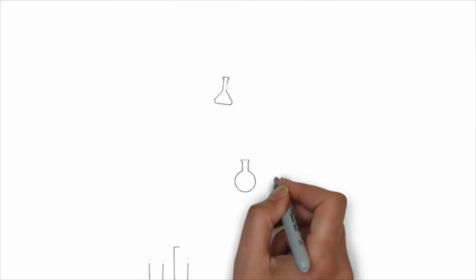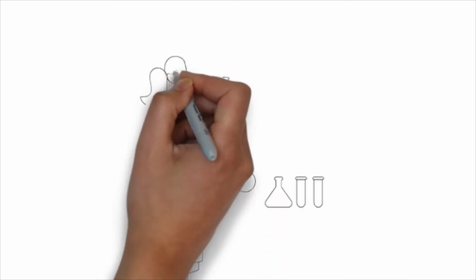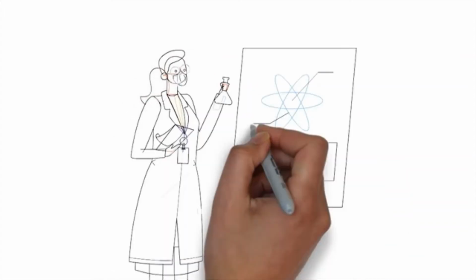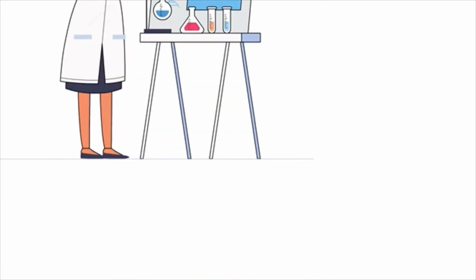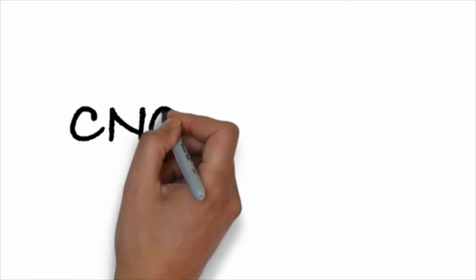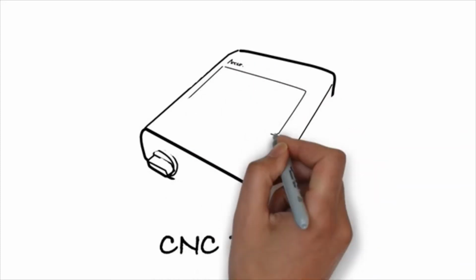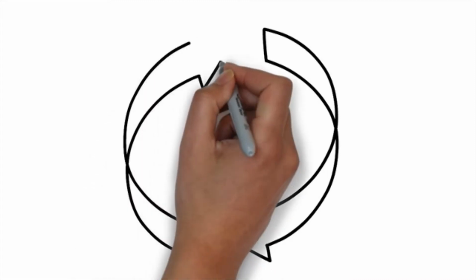Wait a minute. Don't people actually move and breathe when they are wearing respirators? And if a person is wearing a respirator, performing his or her job, aren't they actually challenging the seal more than they would be when they are completely immobile? Again, yes. That's why the exercises in the CNC protocol actually exist, to challenge the seal in a dynamic manner. Obviously, if you are moving and performing a workplace task, you are challenging the seal.